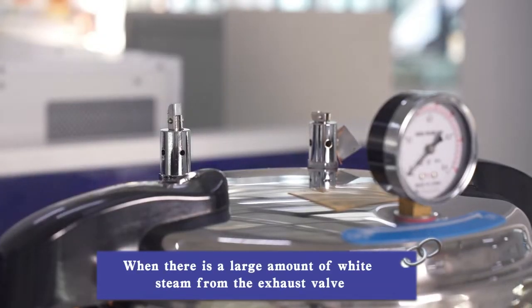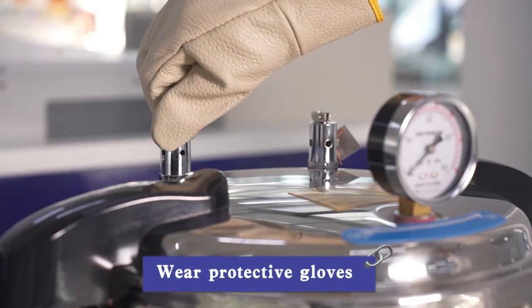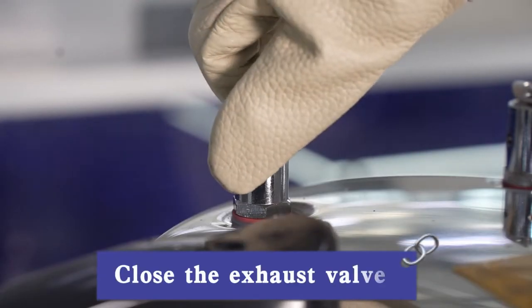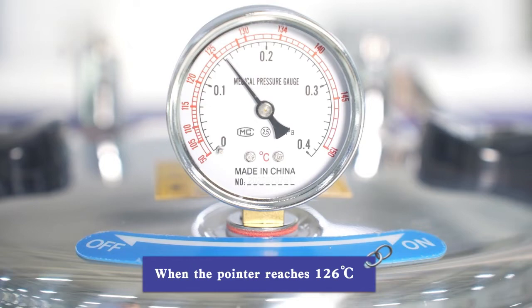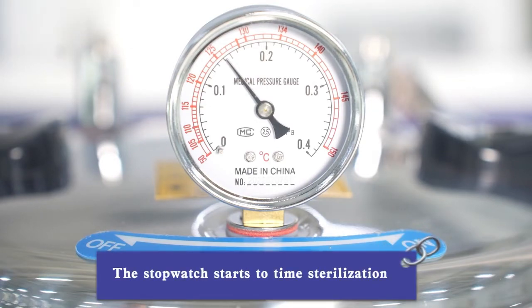When there is a large amount of white steam from the exhaust valve, wear protective gloves and close the exhaust valve. Observe the temperature gauge — when the pointer reaches 126 degrees, start the stopwatch to begin timing sterilization.